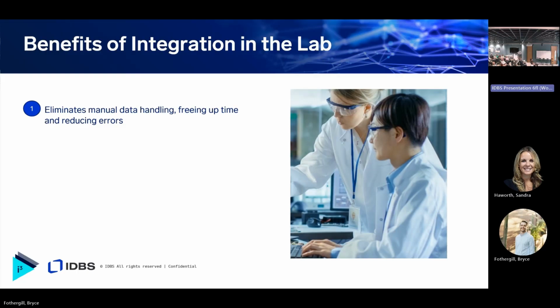Number one, first and foremost, it eliminates the data handling, the wrangling, frees up your scientists' time. It reduces errors. You no longer have to worry about that. That is done for you through the integration. Next, improving data integrity and compliance.